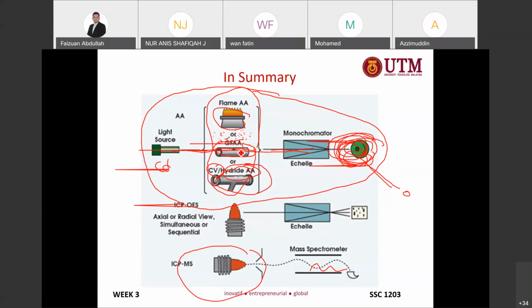If the sample contained cadmium, when it is atomized there will be single atoms of cadmium, and they will absorb the cadmium spectrum from the light source and become excited. The absorption of energy from the light source will be detected by the detector.